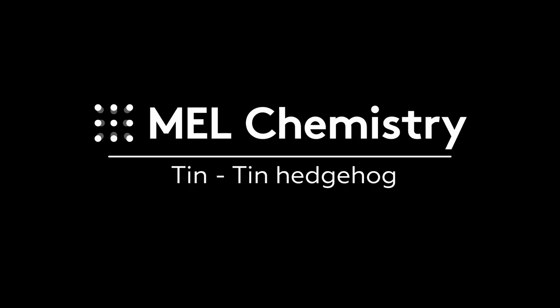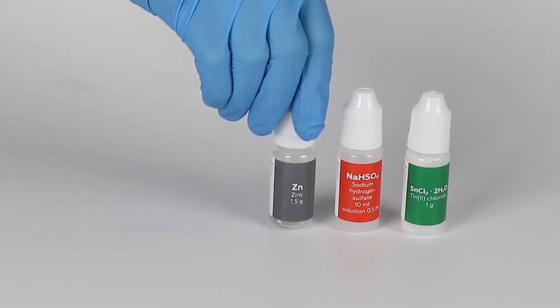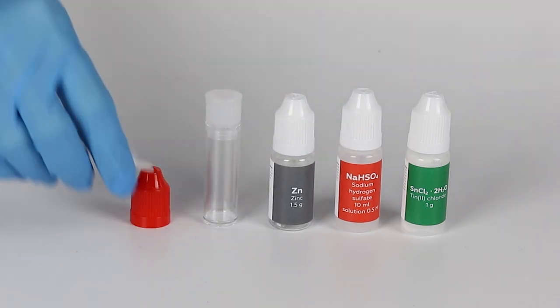For the tin hedgehog experiment, you will need tin chloride, sodium hydrogen sulfate solution, zinc, a vial, a red cap, and a tip.